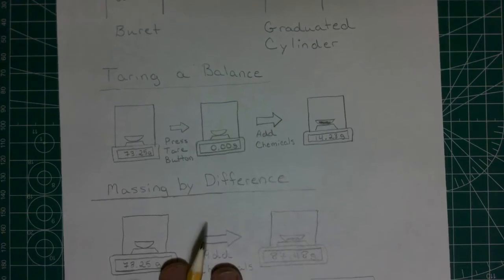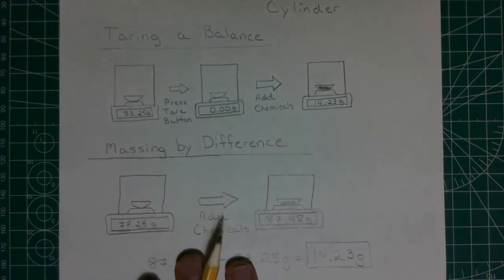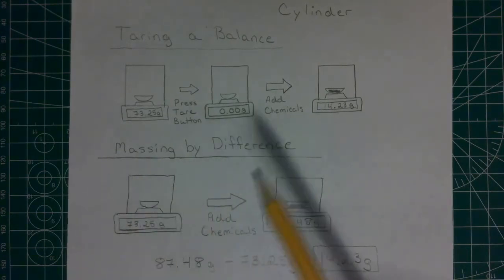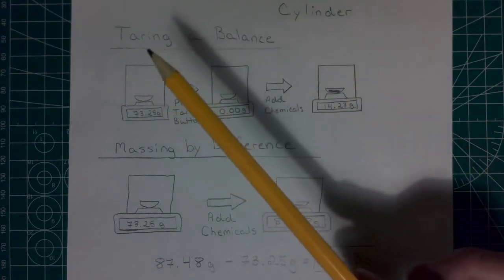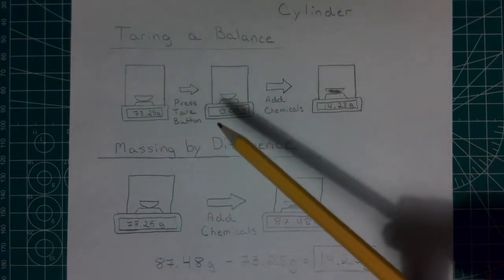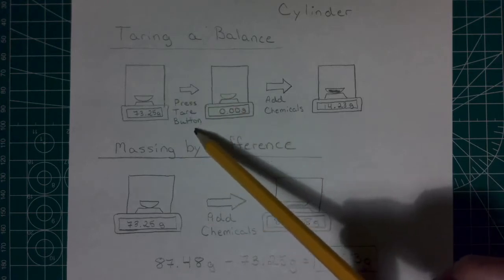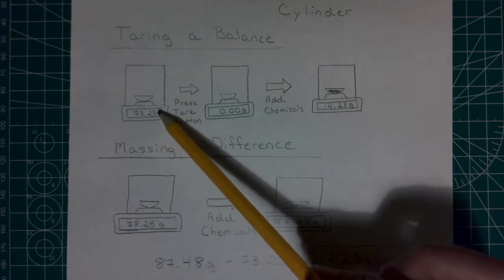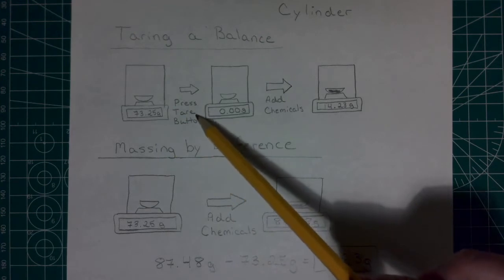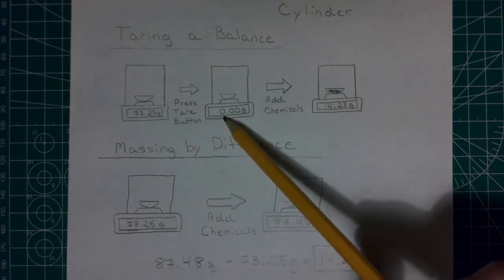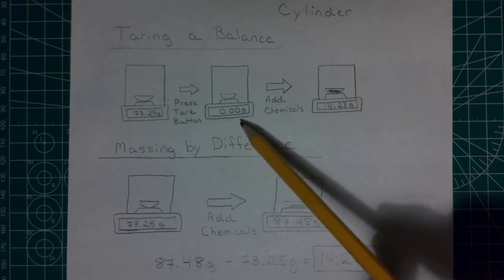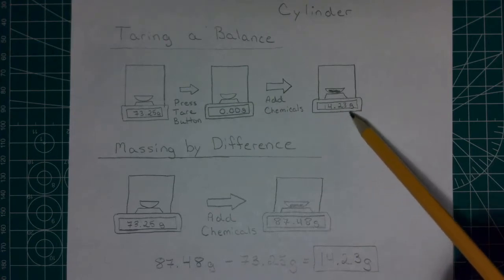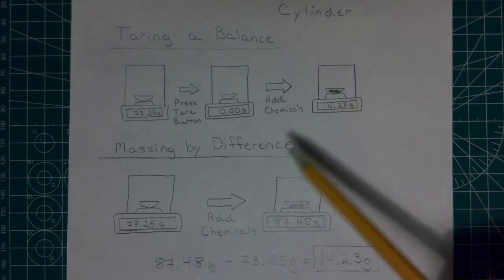The next thing we're going to do is take a look at some balances and determine some masses, and I wanted to explain the two different techniques for doing this. One technique is what they call tearing a balance, and this is a feature that's on a lot of electronic balances that you're going to see now, where I can put a container on the little pan. It's going to have some mass associated with it, and then I just push a button that says tare on there, and what it does is it zeroes that out, so this is now zero grams. And now what I can do is I can add my chemicals, and the values will go back up, and I will get the mass of my chemicals.